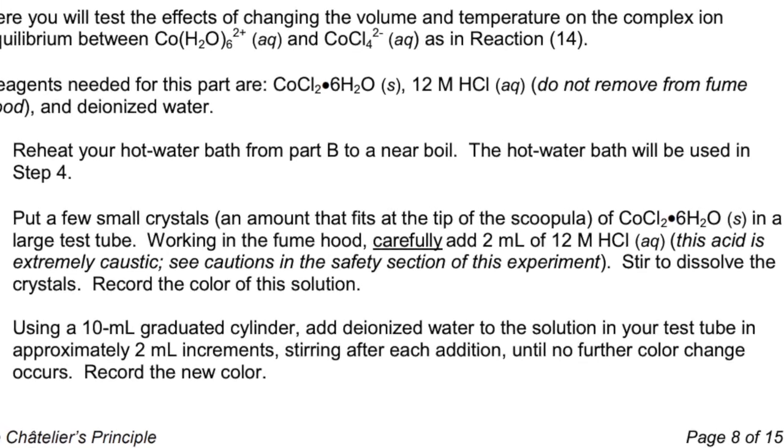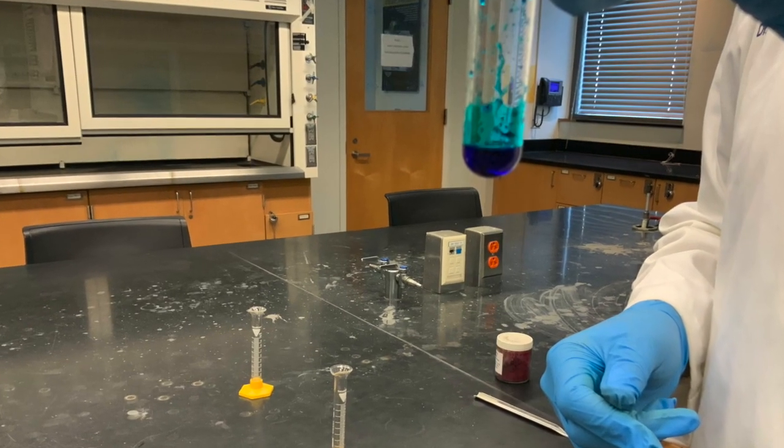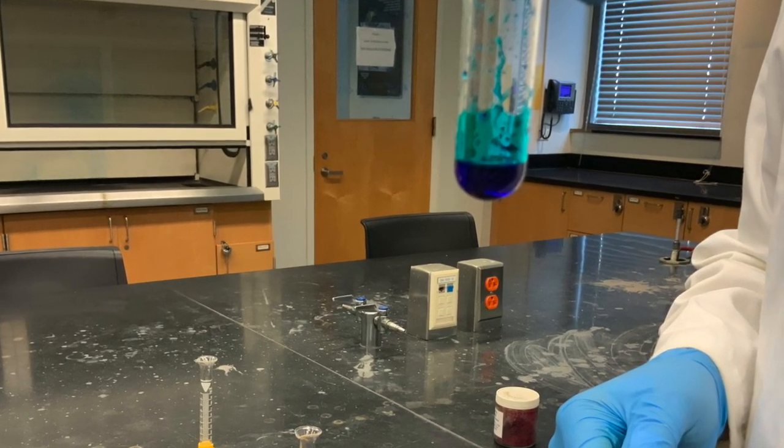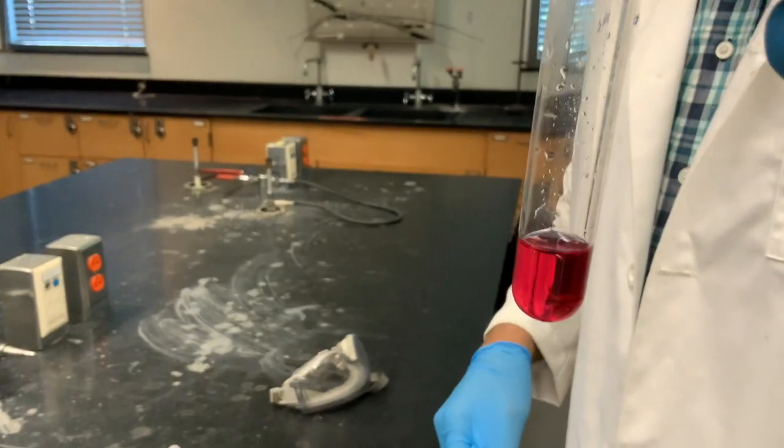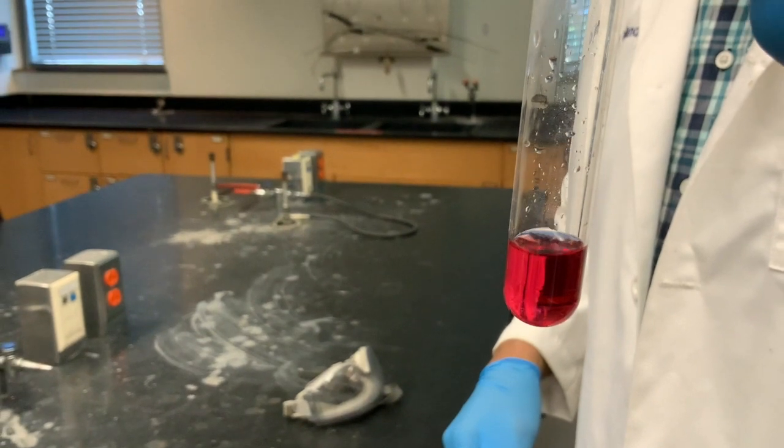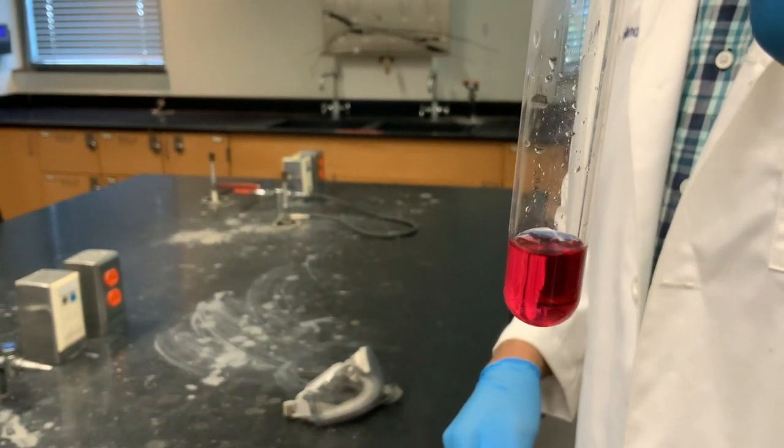Now we continue to Part C, which explores the equilibrium of a complex ion. We start with a solution made up of solid cobalt chloride mixed with 3 drops of 12M HCl. Record the color you observe. We add 1 ml of water into the test tube. We then add another 1 ml and notice a change after 2 ml of water is added. Record this in your lab report.